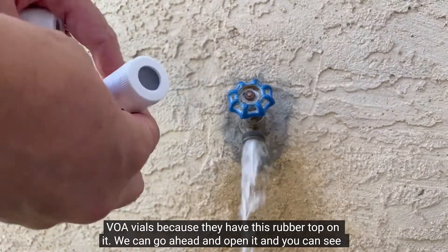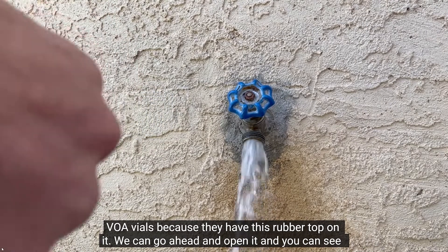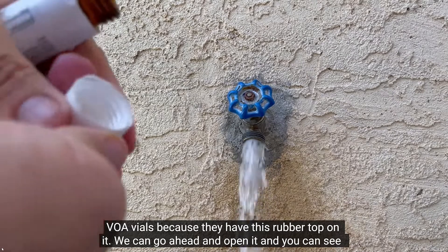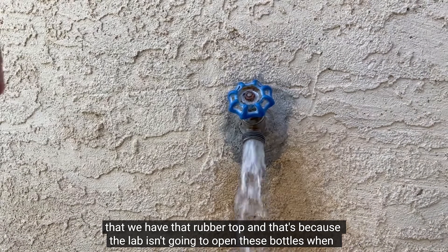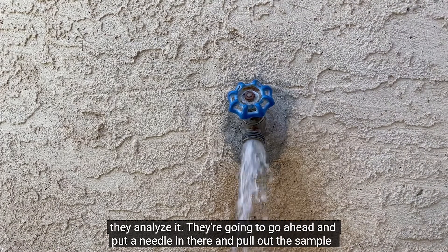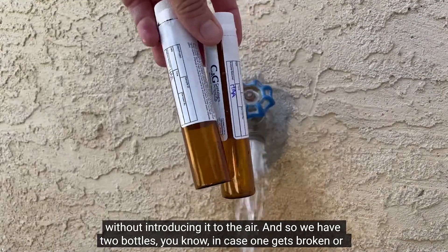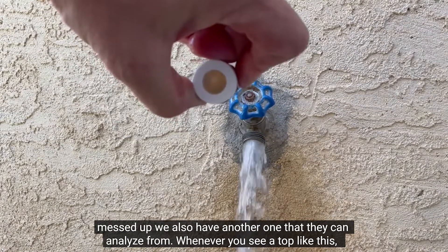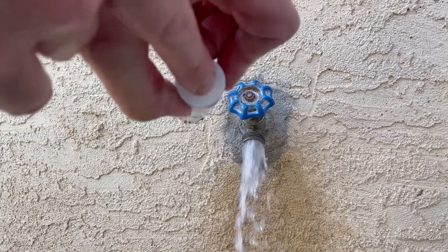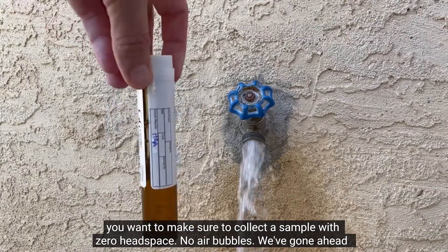We can tell that they're VOA vials because they have this rubber top on them. You can go ahead and open it and see that rubber top — that's because the lab isn't going to open these bottles when they analyze it. They're going to put a needle in there and pull out the sample without introducing it to the air. We have two bottles in case one gets broken or messed up, so they have another one to analyze from. Whenever you see a top like this, you want to make sure to collect this sample with zero headspace — no air bubbles.